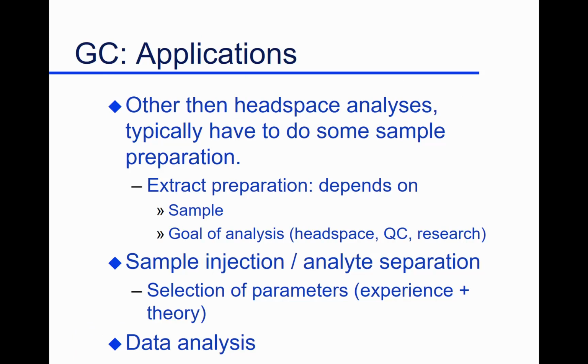Well, let's think about gas chromatography per se. There's a little bit about how you get samples into a gas chromatograph, and that's what we'll spend a bit of time with at this point.